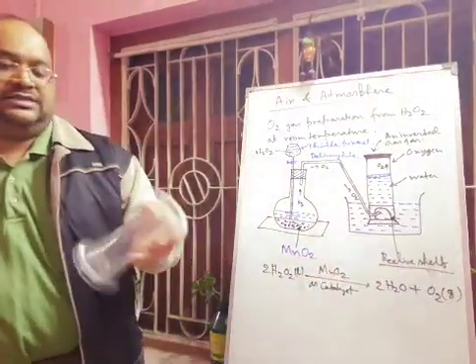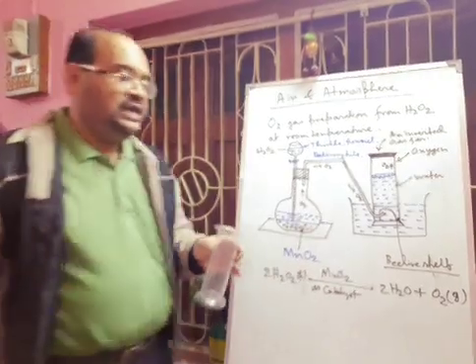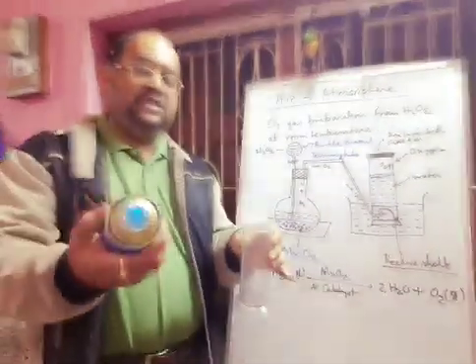Here one cylinder is taken, looking like a gas cylinder, and I have some oxygen also. I am entering some oxygen inside this from this can.